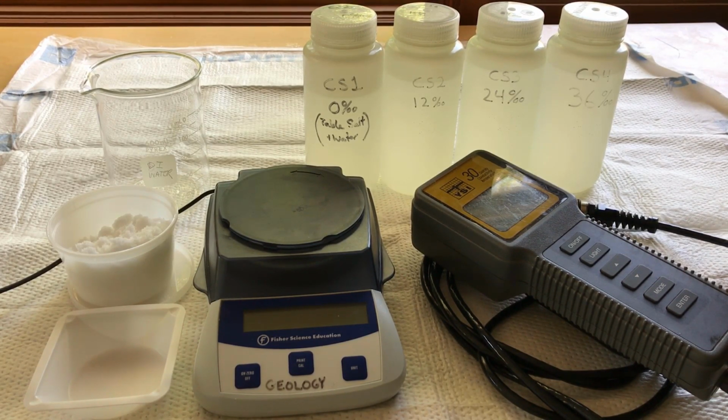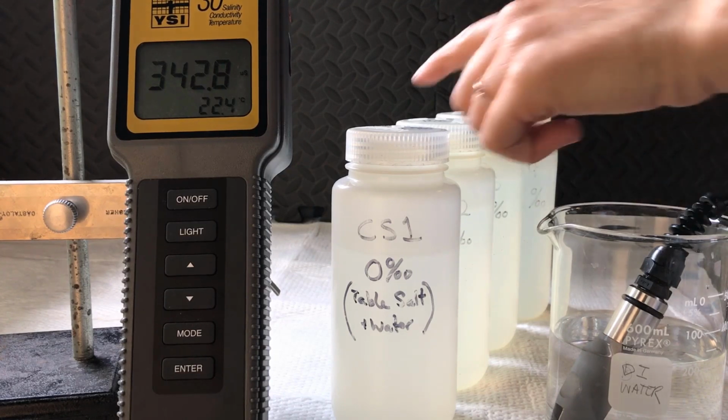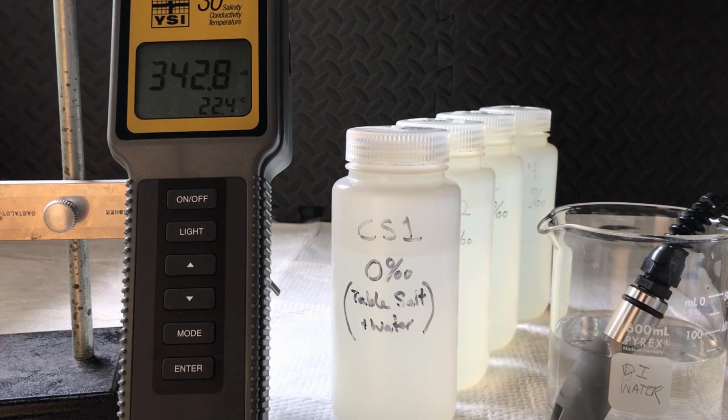You will record the conductivity meter readings from the video into tables 1 and 2 of your lab. Be sure to have your lab and a pencil ready. In Part A, our goal is to create a calibration curve based on our calibration standards. Later, we'll use this curve to determine the salinity of 6 solutions based on their measured conductivity. We're going to use this conductivity meter to measure the conductivity of these 4 calibration standards. These data should be recorded into Table 1.